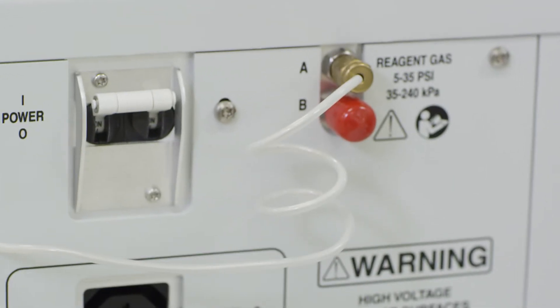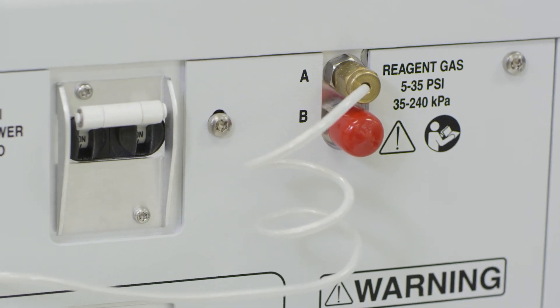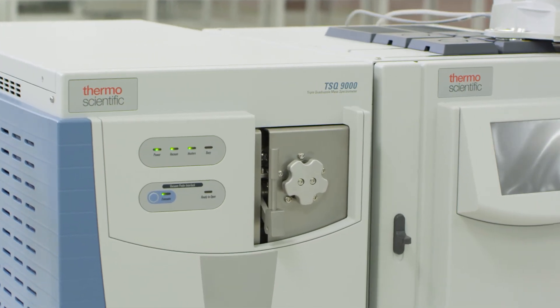The reagent gas line needs to be plumbed into the instrument if it hasn't been already. The port for the reagent gas is clearly labeled. The instrument software is now ready to be configured for CI operation.